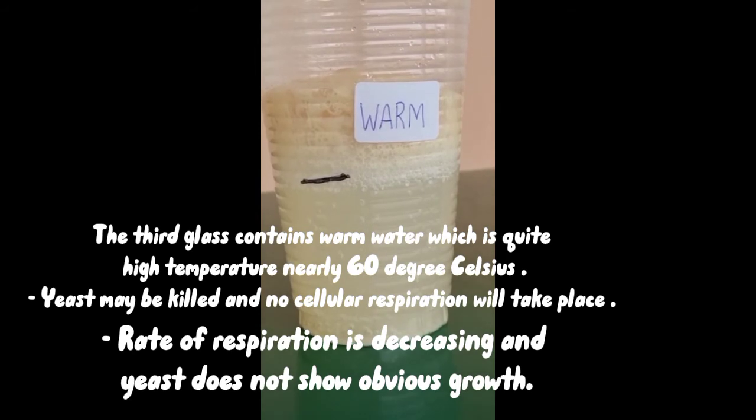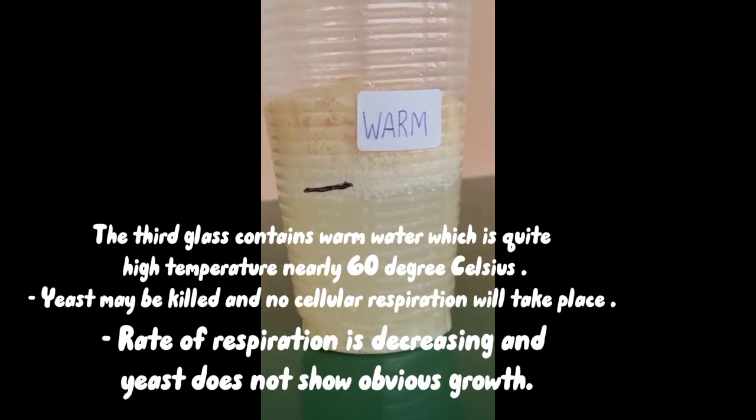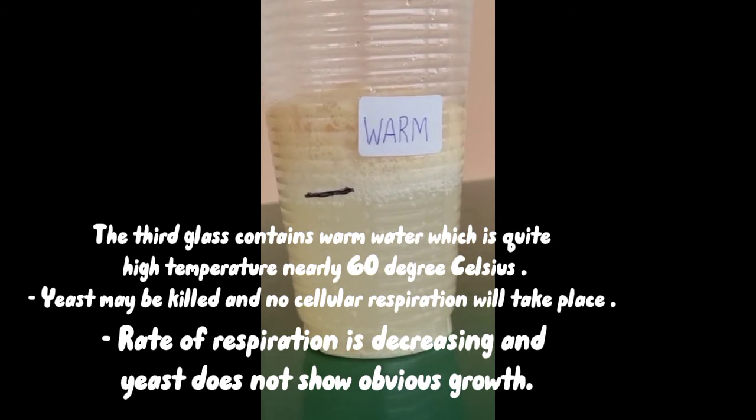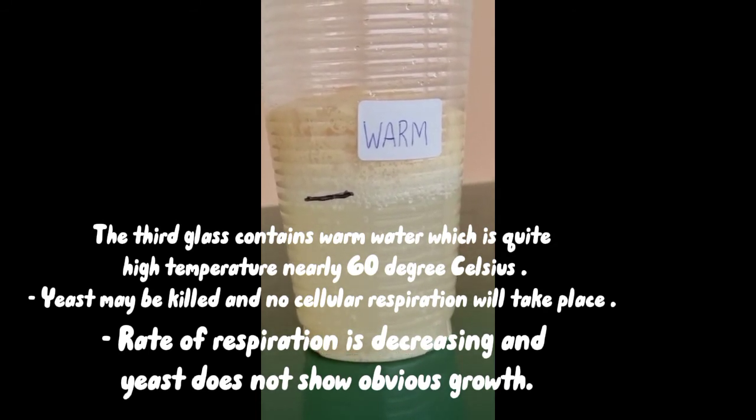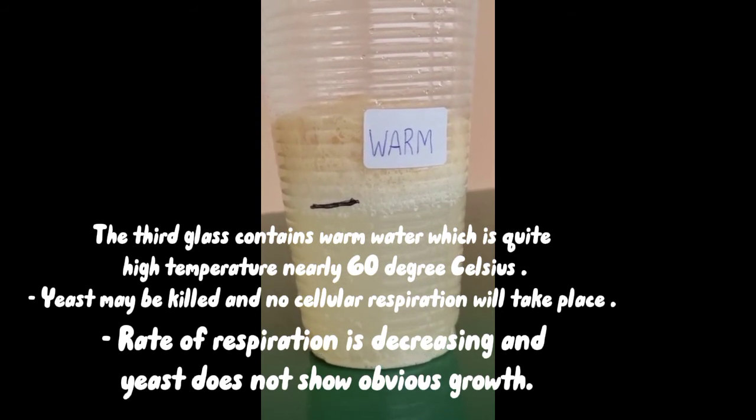The third glass contains warm water, which is quite a high temperature, nearly 60 degrees Celsius. Yeast may be killed and no cellular respiration will take place. The rate of respiration is decreasing and yeast doesn't show obvious growth.